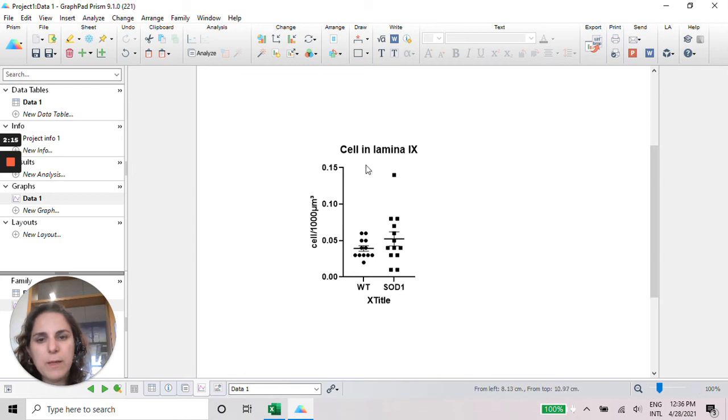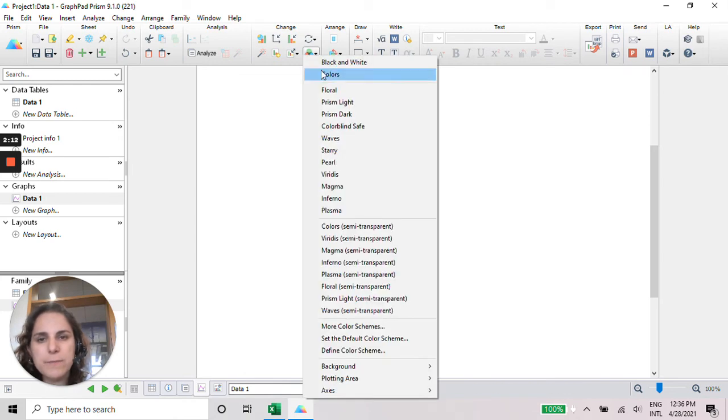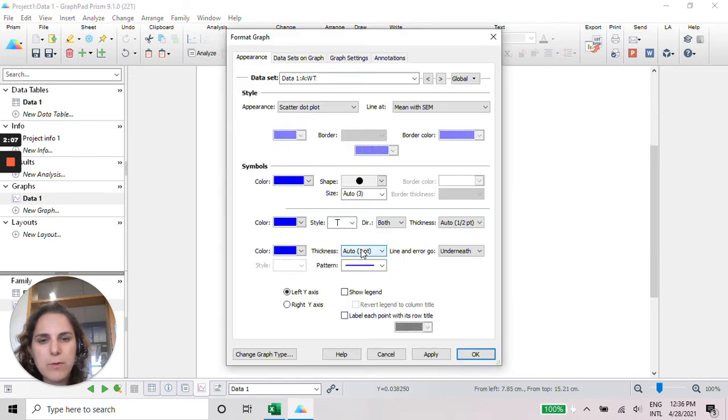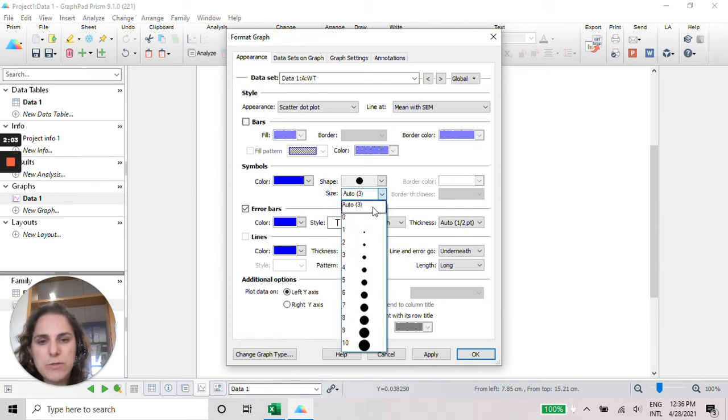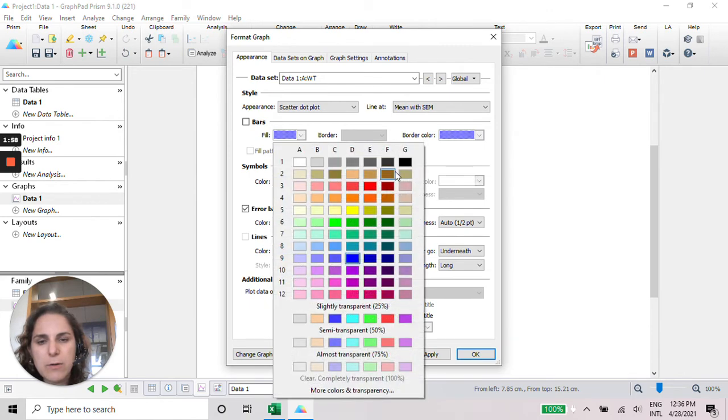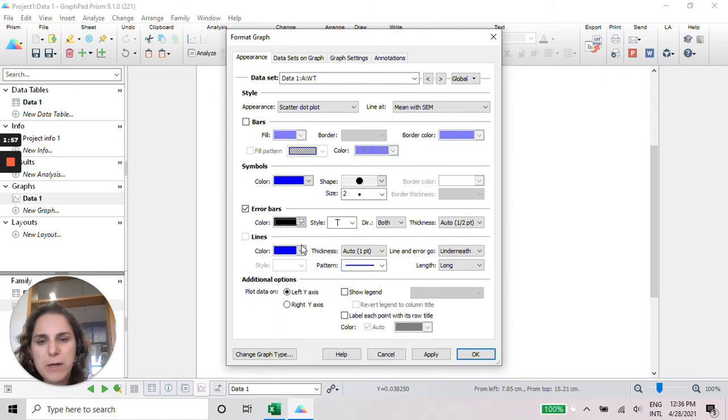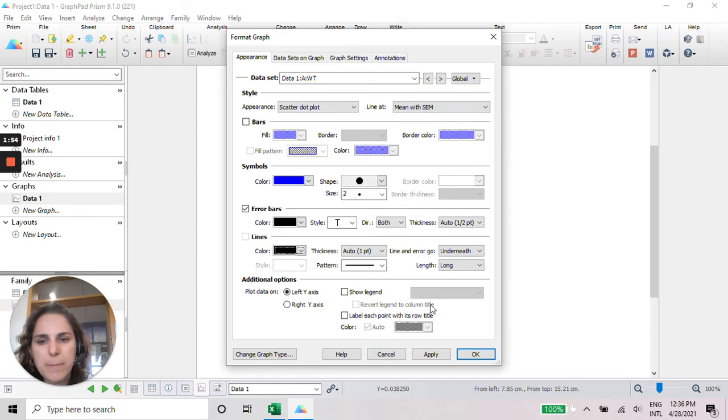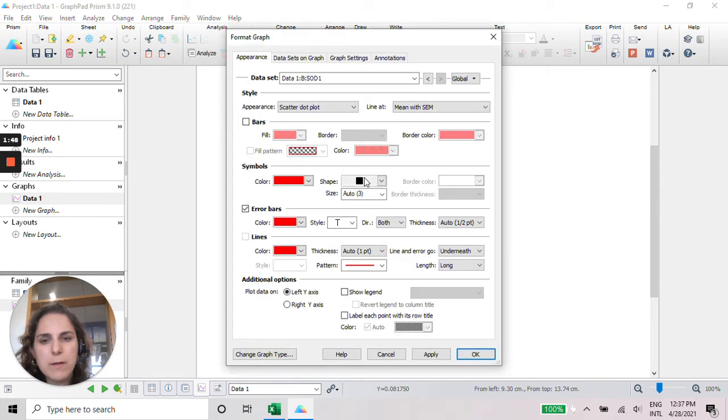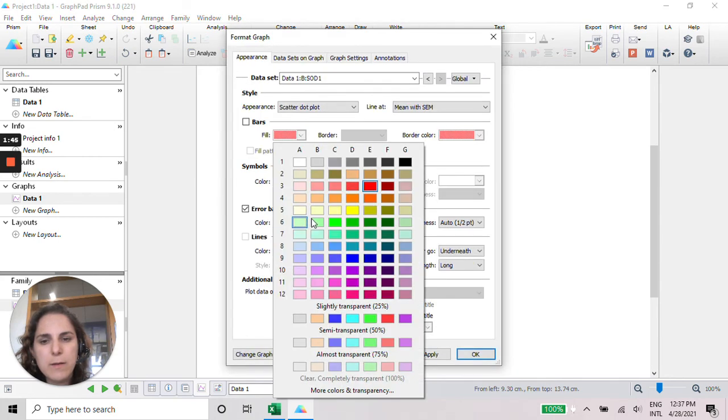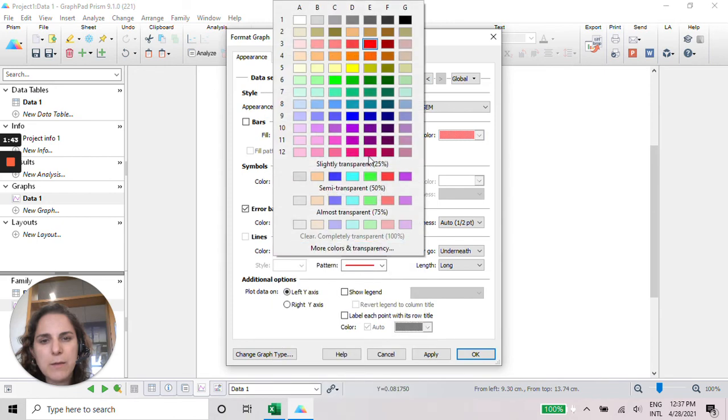We can also change the color of the graph here. And if you double click in here, you can choose a different color if you want. Change the size of the dots and the colors of the bar. The arrow bar and the mean bar here. So I'm going to leave it in black.